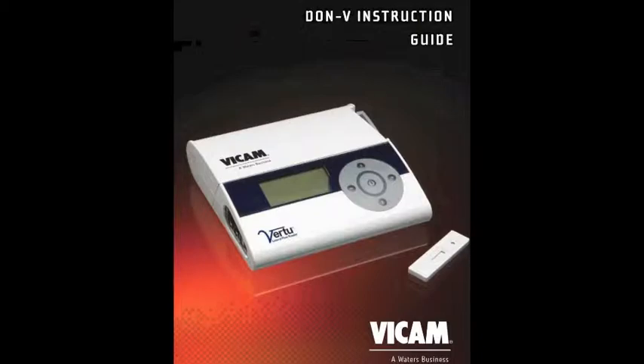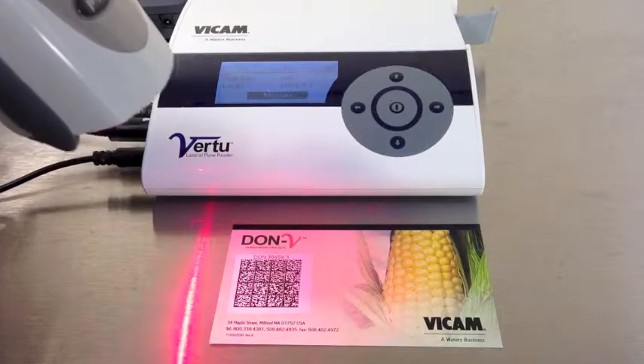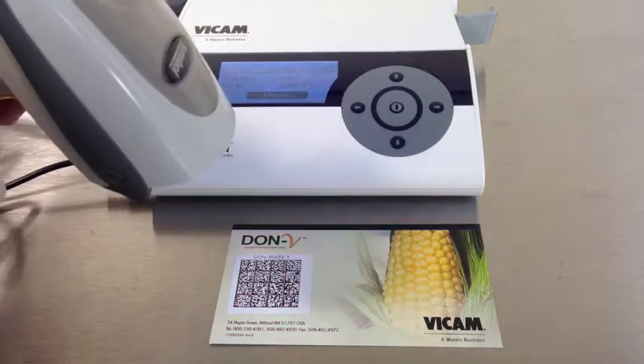The Vertu unit is capable of testing different commodities and toxins like Aflatoxin and Don. To select the test, scan the barcode on the test card provided with each lot of test strips. The screen will change to show the current test as well as the lot number of the strips.